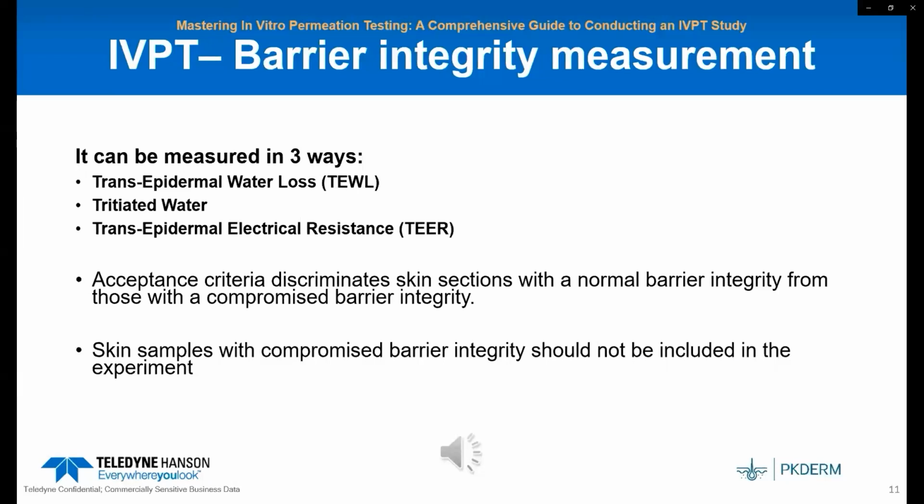At PKDERM, we use a Tewameter system to measure the TEWL. Normally, the value of TEWL should not exceed 15 grams per square meter per hour, and skin samples having higher values of TEWL should not be included in the experiment.